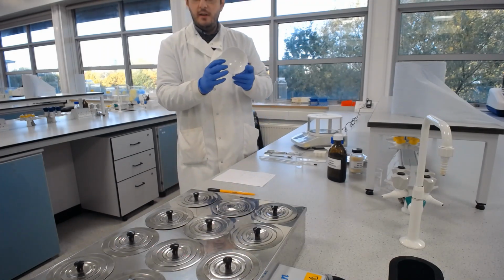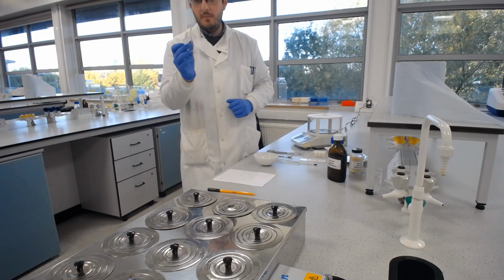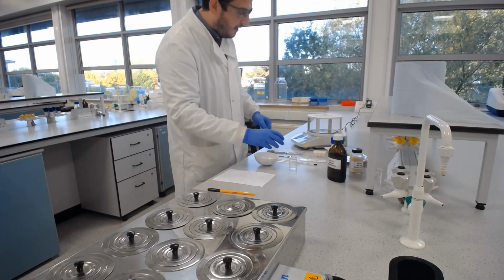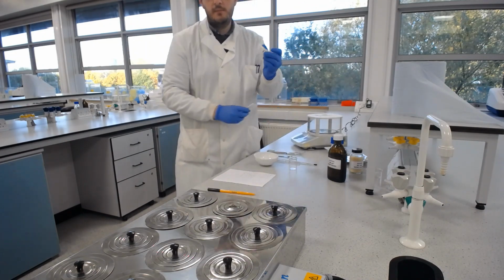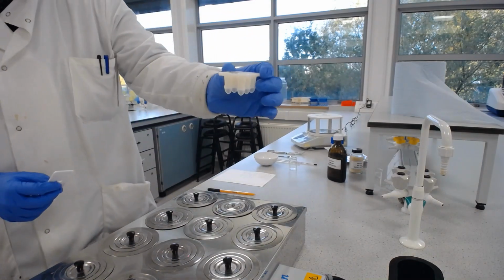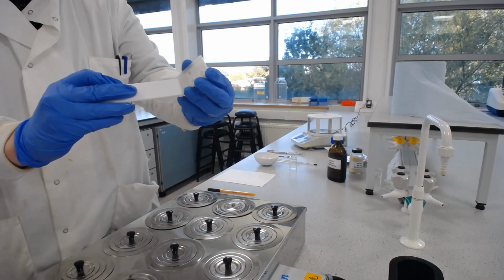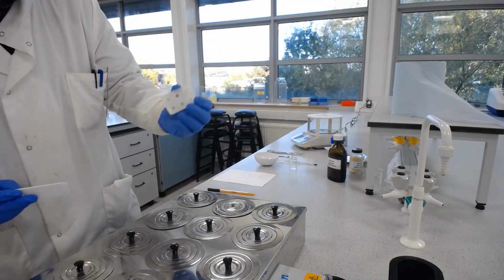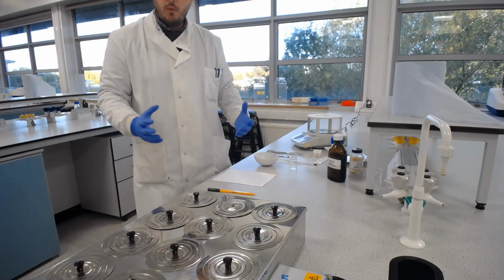We have an evaporating dish to go on the water bath. Have a beaker to mix and go on the water bath. And we have weighing boats, foil, and we have our suppository mould, which I'll show you a close-up of. So that's the suppository mould. And we have a scraper here for taking off any excess along the top once we've poured the molds. So I'll get on and do what I need to do.